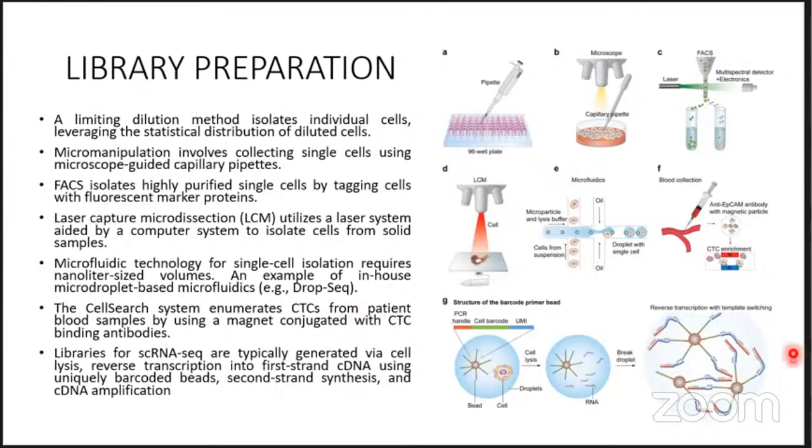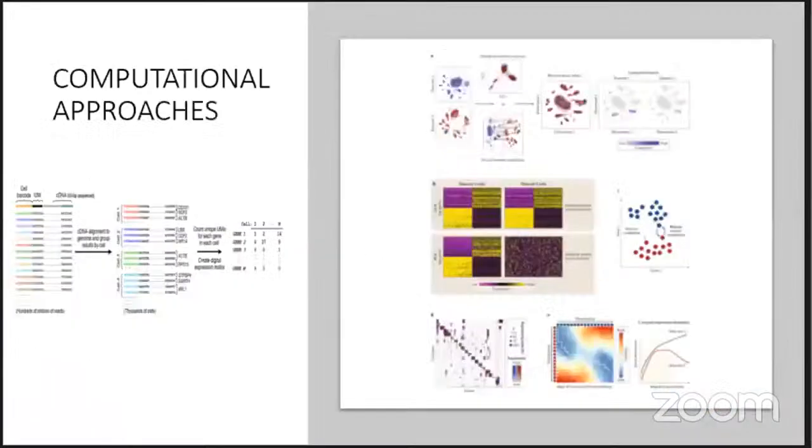So now we have the cells. Basically we have different kinds of cells from the same sample, and each cell will have a different kind of data. How do we identify which data belongs to which cell? Let us have a look. When we get the reads, it will be a mix of reads. But the beauty of single cell genomics is that each read has a barcode in it.